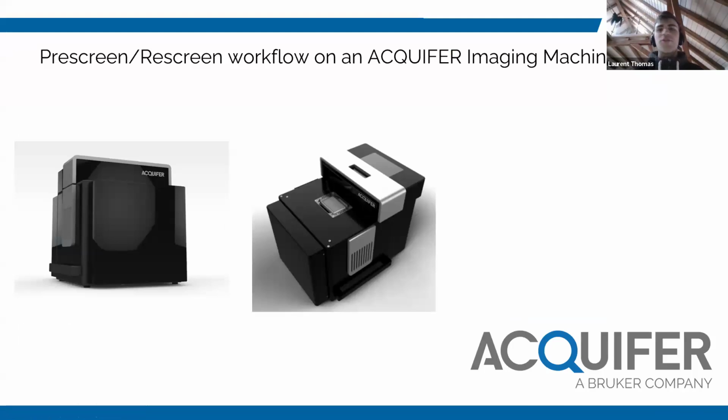I'm working as a software developer for ACQUIFER. ACQUIFER is a microscopy company based in Heidelberg. You might know us for the Hive. It's a centralized workstation for data storage and processing. But we also have our own microscope.